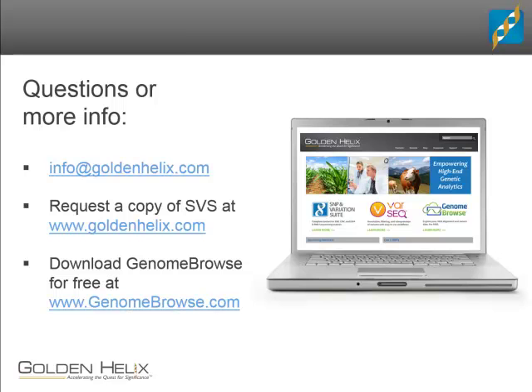Another question, LD pruning for rare variants. Are rare variants in LD? That question would have come in about the time that I mentioned LD pruning. Keep in mind that the filter that we used there was to first reduce only to variants with an observed frequency greater than 1%, which with the sample size we have indicates a very large number of individuals carrying it. We should be able to detect LD at that level pretty well.